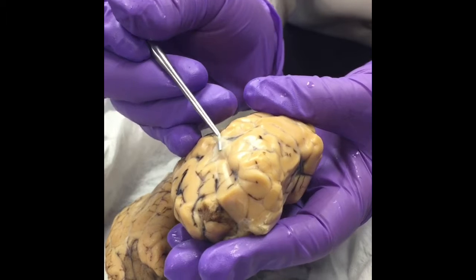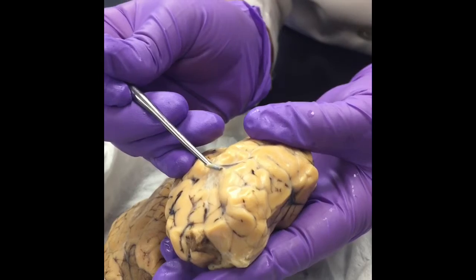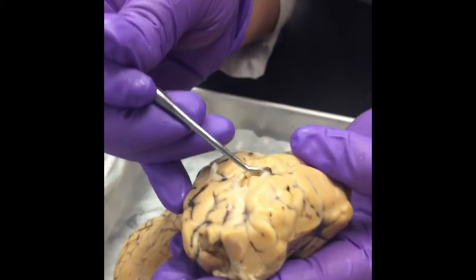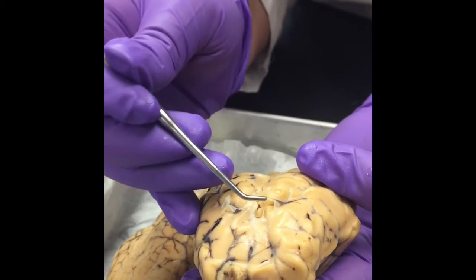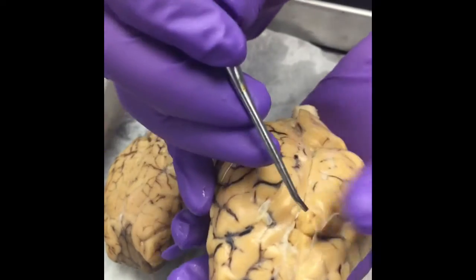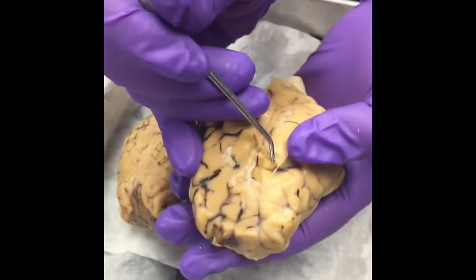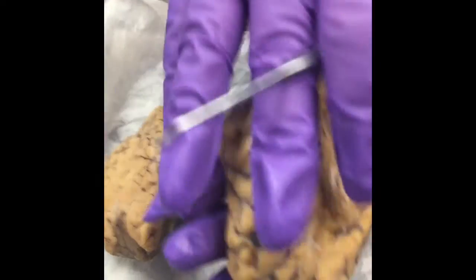They call it arachnoid because when you look at it under a microscope, it has little fibers that look like a spider's web. Okay. So you can actually peel that layer off. And then there's a layer that you really can't see, but we know it's there because you see all these black lines. Those black lines are capillaries. So the capillaries are embedded in a third membrane, but look what happens when I try to pick up that membrane. It actually starts to break away the brain matter. That's called the pia mater, the third innermost layer there. You really can't separate it. Okay, gonna flip it over.